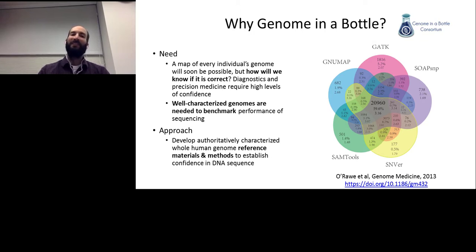And we've sequenced these with many different methods and tried to disseminate benchmark variant calls and benchmark regions that can be used to evaluate your sequencing method's performance. And we've also done a lot of work towards providing benchmarking methods so that you can compare your calls to ours in a standardized way and make sure that you're getting accurate and meaningful performance metrics in the end that you can compare across experiments.